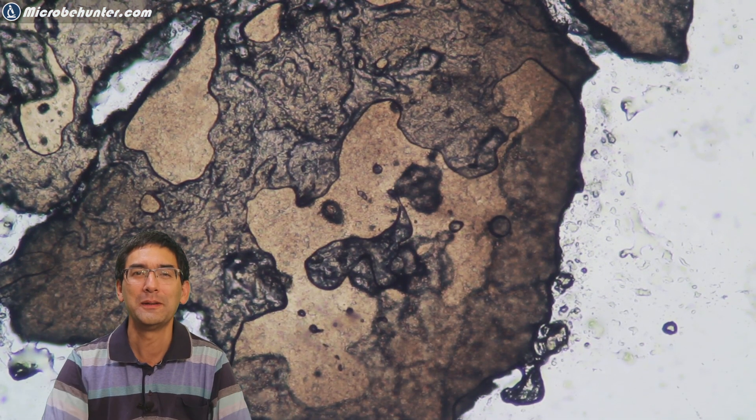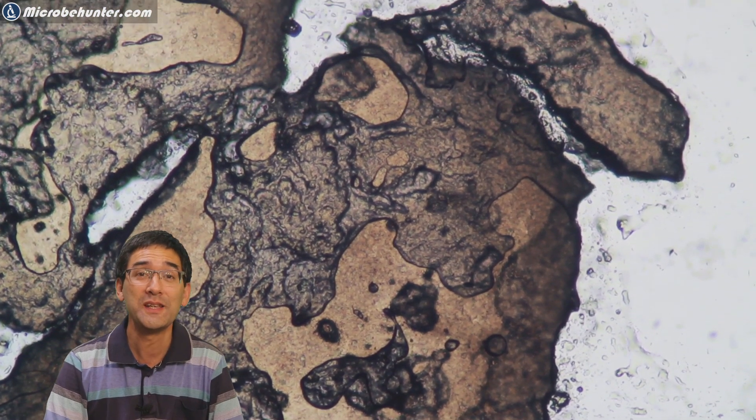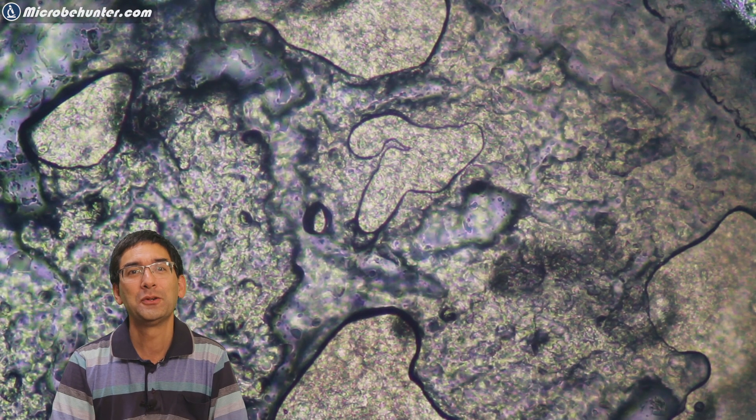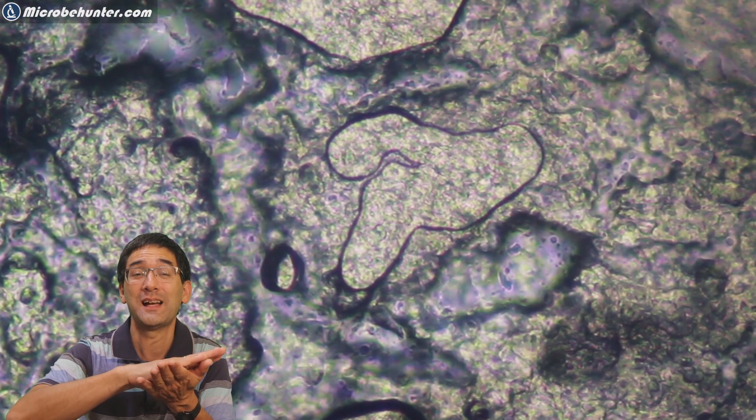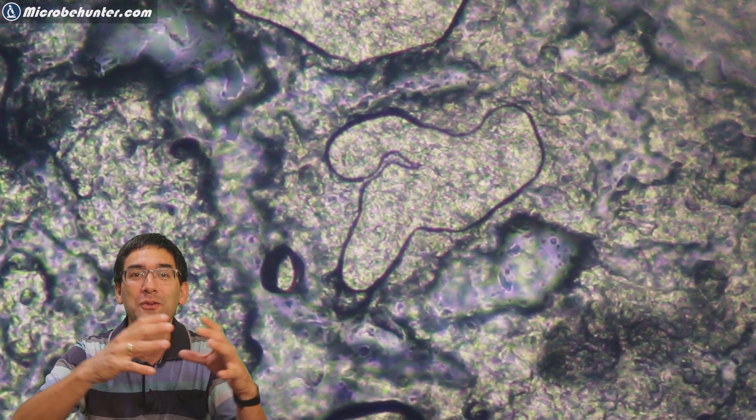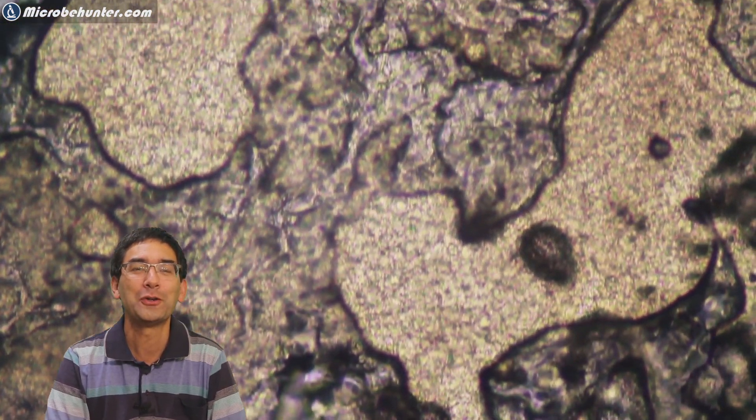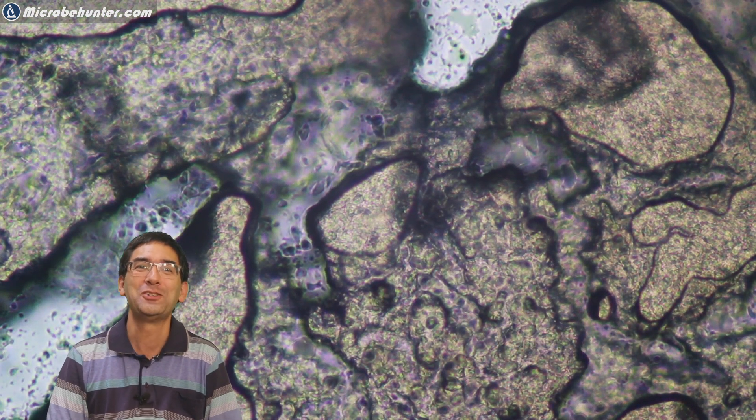I put it under the microscope - looks a little bit like modern art. Very irregular shapes, no cells visible because it's all milk protein. Relatively random shapes, but I could also see some expanding bubbles where the cheese, which was connected to the glass slide, started to separate. That's why you could see more and more of these bubbles that are growing. I think a nice piece of modern art. When you hang it on your wall in a picture frame, you can have other people guess what this is. Nobody will guess that's actually the cheese of a hamburger.